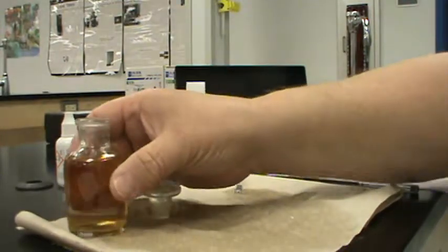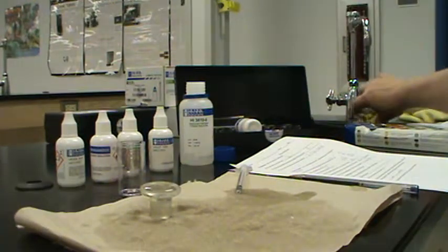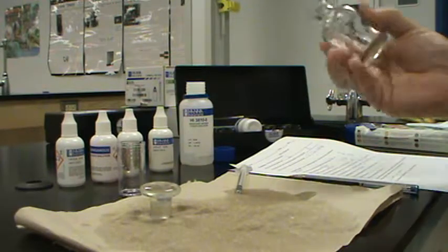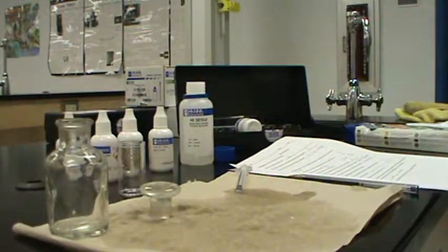And that concludes our dissolved oxygen experiment. So this water, very, very good. And remember, dissolved oxygen, the more oxygen, the less chance that there's anything growing in it, because oxygen kills bacteria. Oxygen kills many of the organisms that grow in water. So the higher the oxygen level, the better the water is for us as human beings if we wanted to drink it. And that concludes the dissolved oxygen experiment.